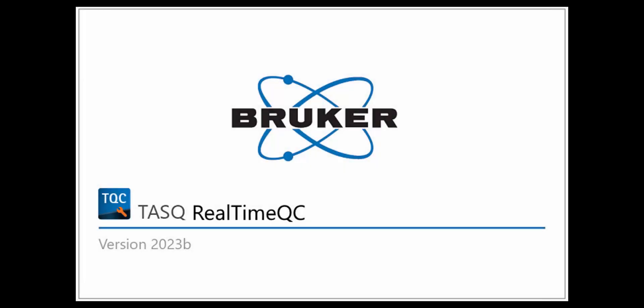Bruker Life Sciences Mass Spectrometry introduces TASQ RealTimeQC, Your Guide to High-Quality Data Acquisition.